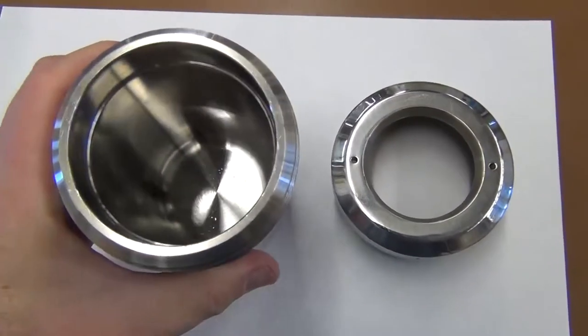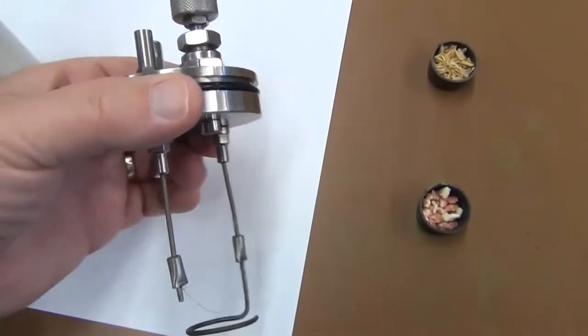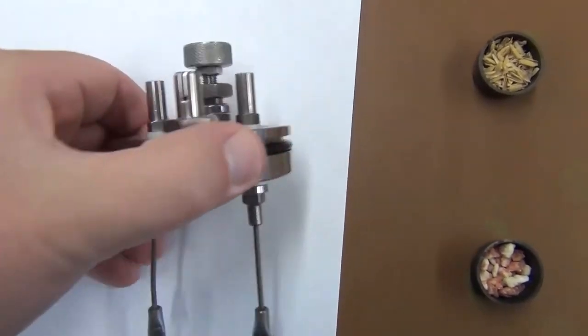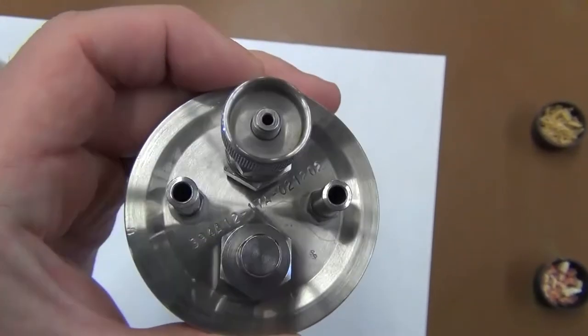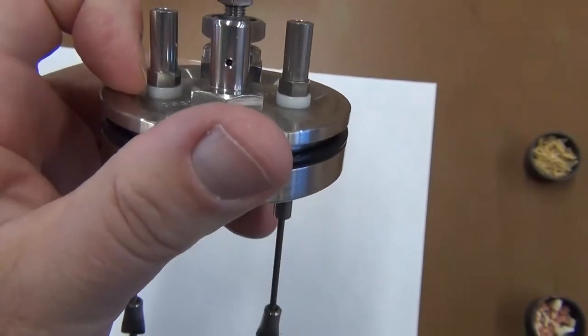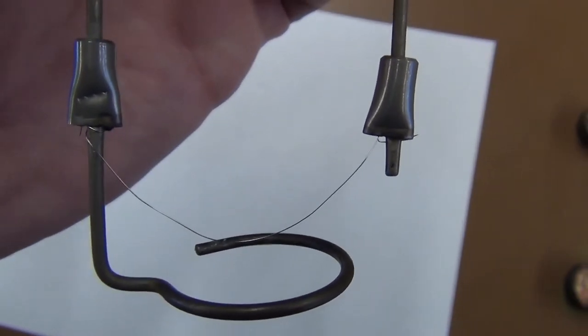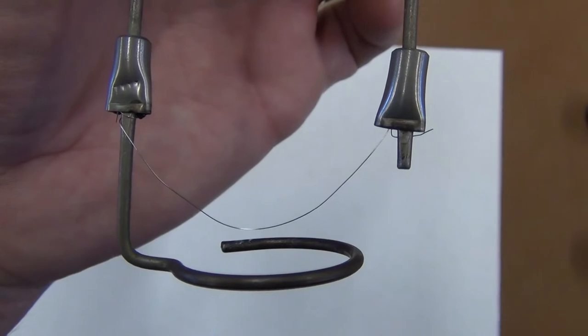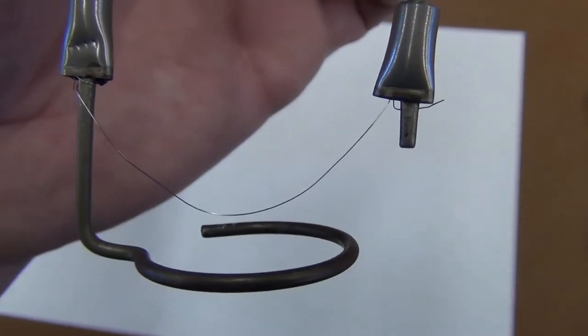Here we have the actual container and next to it is the lid which goes on top. There are two electrodes on the top that serve to allow us to pass an electrical current down through these insulated holes to this nichrome wire. This is nothing more than toaster oven wire, but when you apply a current to it with 20 atmospheres of oxygen, it's going to oxidize readily and ignite whatever fuel we've put inside.